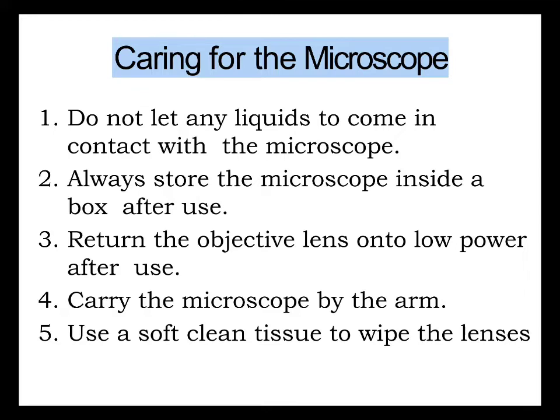Remember that this is kind of sensitive also. A microscope is a very sensitive machine for the laboratory because it is always used. Okay? So for that, I want you to answer the activity sheets given to you.